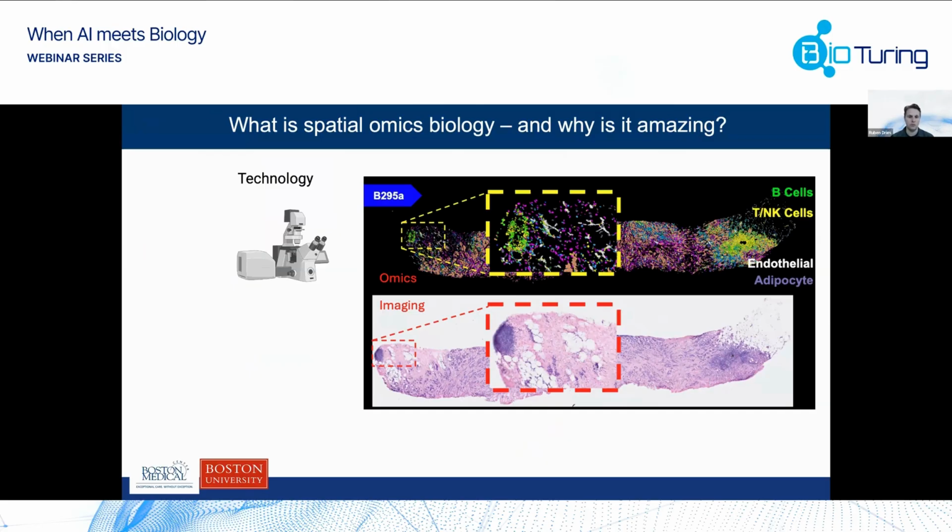And so with that information, for example, from transcripts, proteins, lipids, anything you can think of, you can start decoding what the different cells are, for example, B cells, T cells, and you know the exact location. And it's that combination that makes it really, really powerful. But there's a lot more that I think is really something we should highlight.